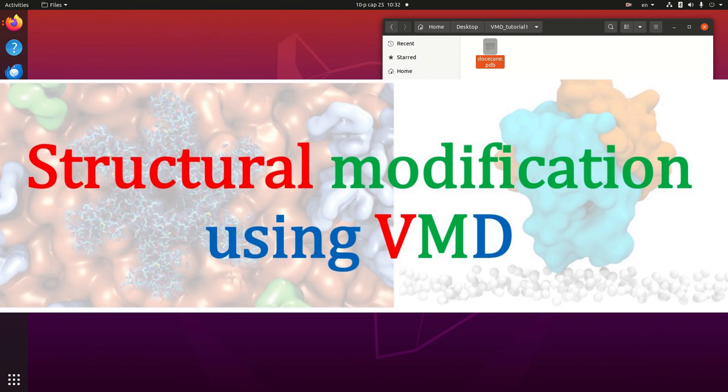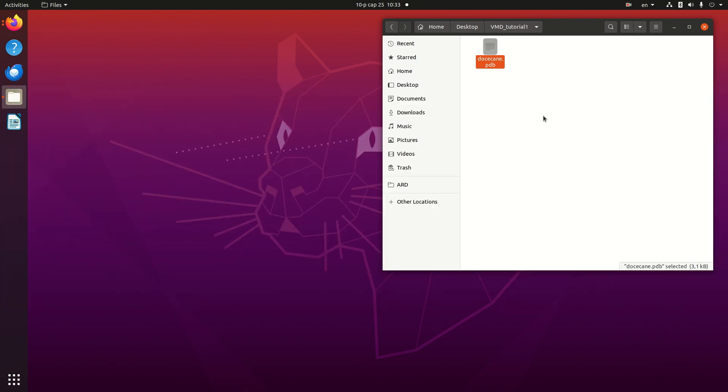Hello, in this tutorial I would like to show you structural modification using VMD. VMD uses different representations around the modifying section.